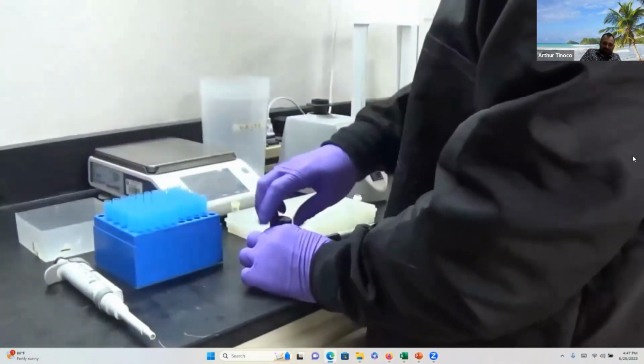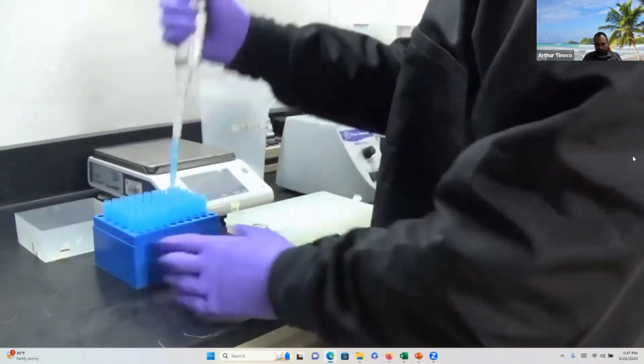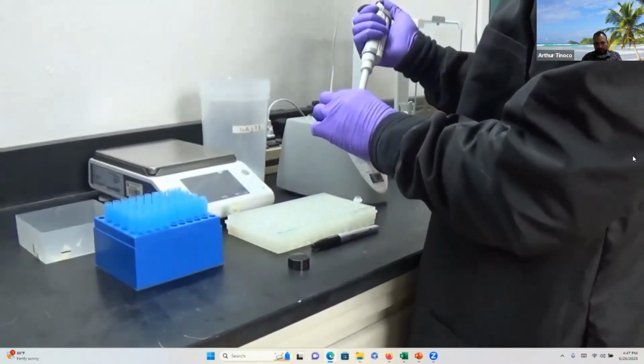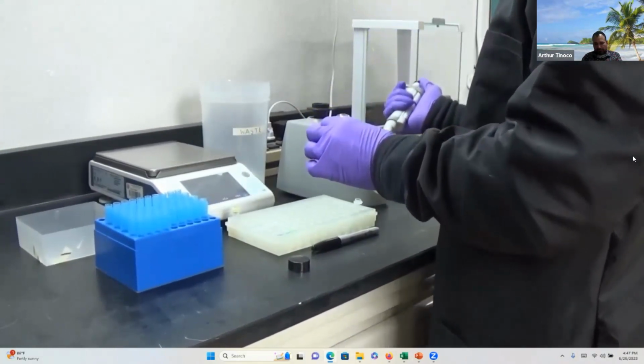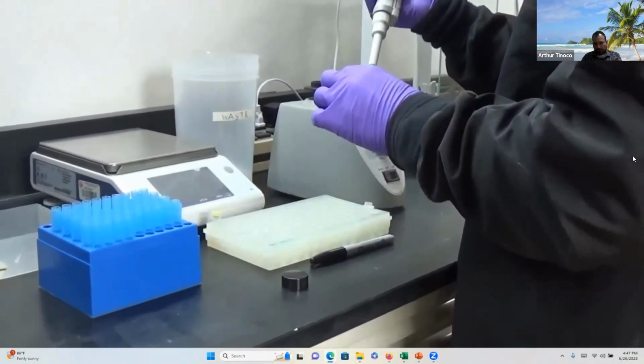I then add the corresponding volume of the matrix solvent in order to obtain a final concentration of 5 milligrams of the matrix in 1 milliliter volume of the solvent.